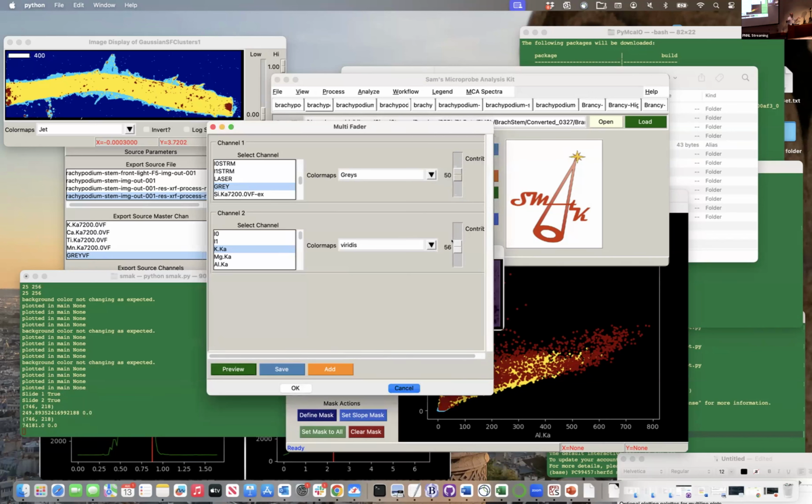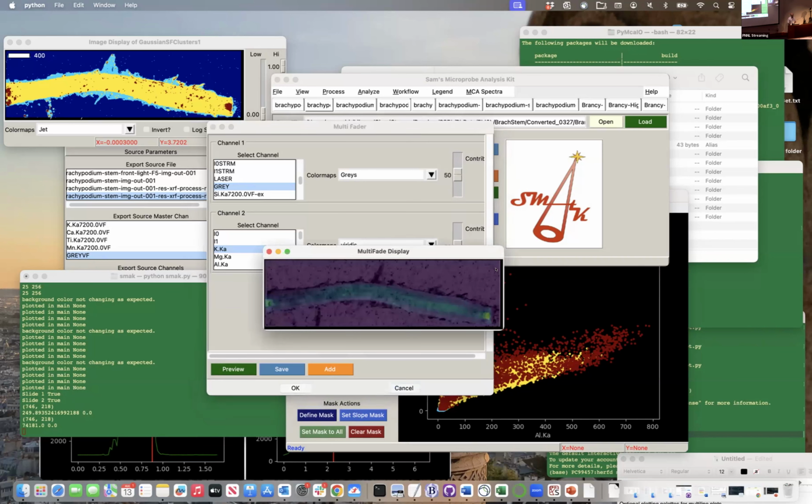This is kind of like putting it together as a single image still, but I'm giving different color maps to each fader. Now, the one thing I've not liked about this so far is that I get this purple background everywhere on my low counts. That's the bottom of the color map. And when I use a color map like Jet, it's even worse.